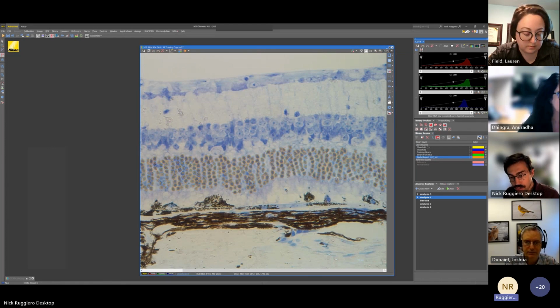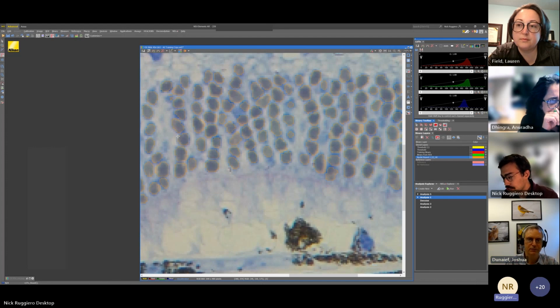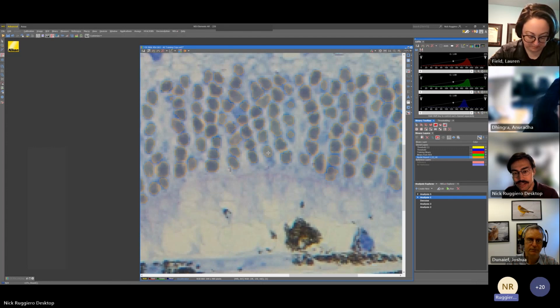If I want to zoom in on this and modify it, like, ooh, here, perfect example, it accidentally grabbed a double binary. I can manually edit this, and I can save this binary. So I can go in and retouch up anything. Sorry, I'm probably looking at the wrong camera. I can go in and manually touch up anything. And this is also how I would retrain the binary. So if you find that it doesn't get it quite right, let's say this is 2 cells, maybe.